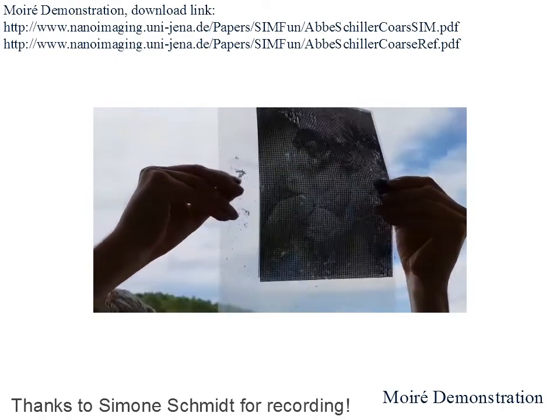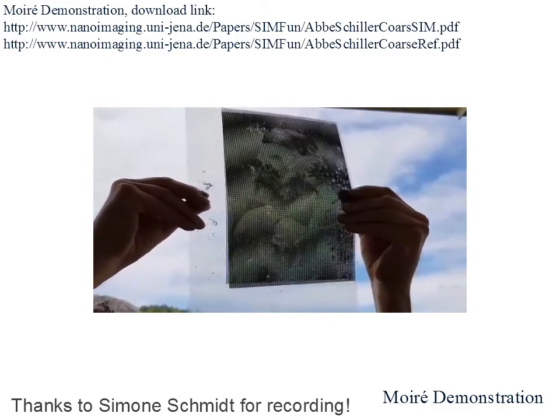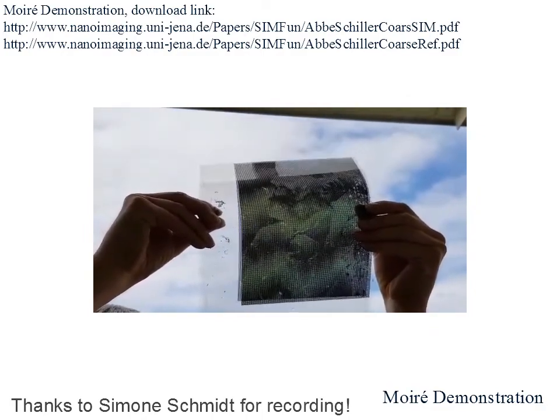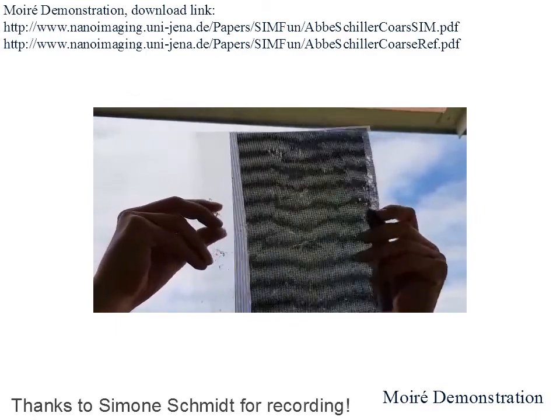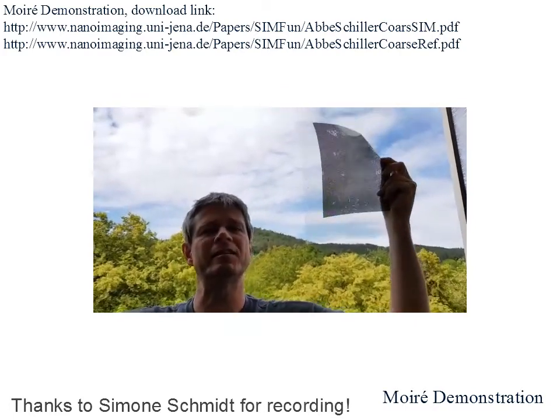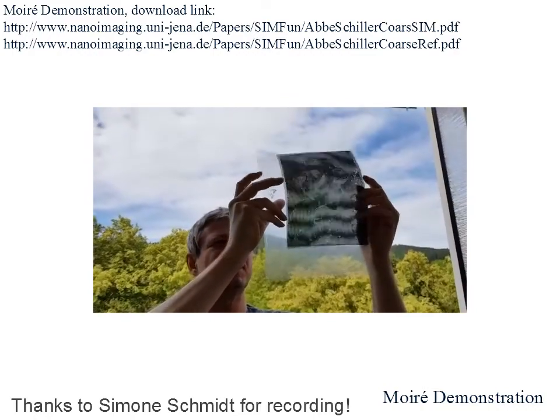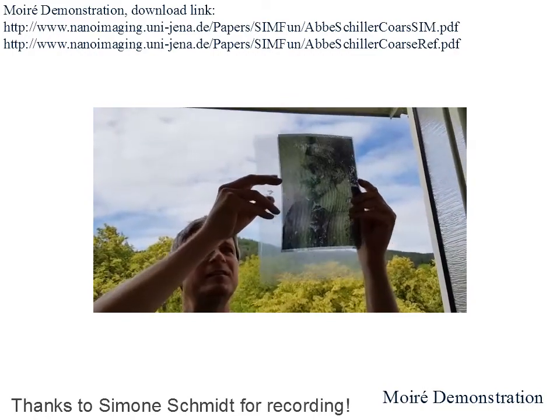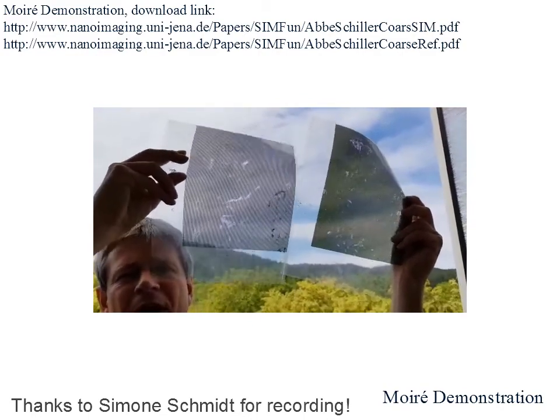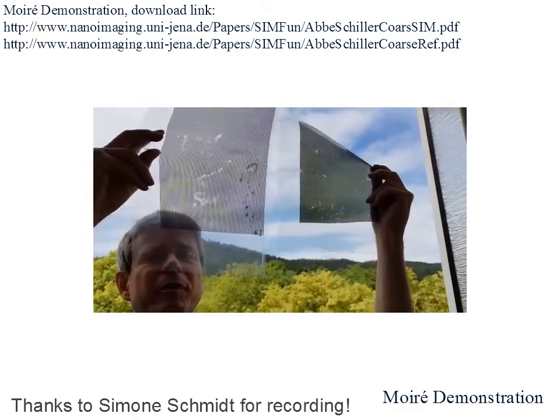And when I ever so slightly shift these patterns, you see how the contrast in this image varies, and that can be measured. This way, via structured illumination, you can actually reconstruct the high frequencies. In a way I'm a little bit cheating, because what we are really interested in is this high frequency information in here, and not the low frequency information that I'm showing here. However, you can reconstruct that high frequency information with the knowledge of the overlay pattern, the structured illumination that you're putting on your high frequency information in the image.